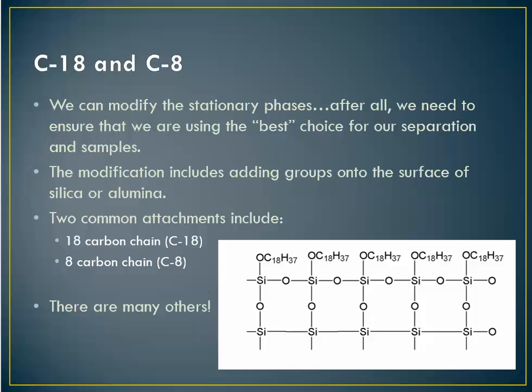Okay, so we need to talk more about what's happening inside of this column. And a new word is going to come about. This new word is called adsorb. Over to the side, I'm going to write a new word: absorb. These two are not the same. I can't stress that enough. Adsorb is different than absorb. So you have to be careful in the way that you say it and the way that you write it.